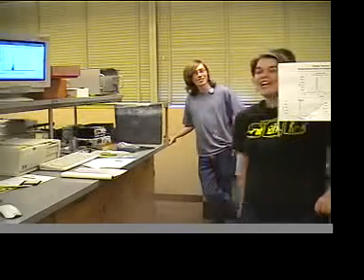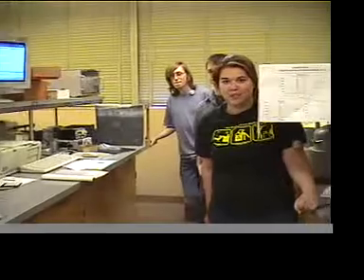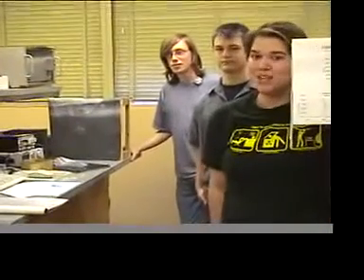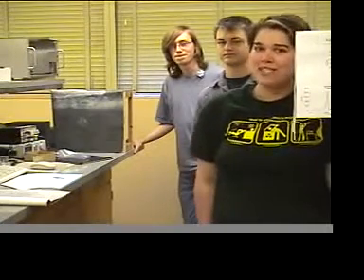And I'm Ken. And we're from Cal Poly in San Luis Obispo, and we'll be describing the X-ray spectroscopy lab. The general purpose of this lab is to analyze the elemental composition of metallic samples and to verify Moseley's law.